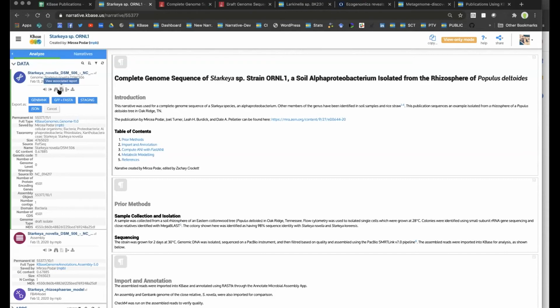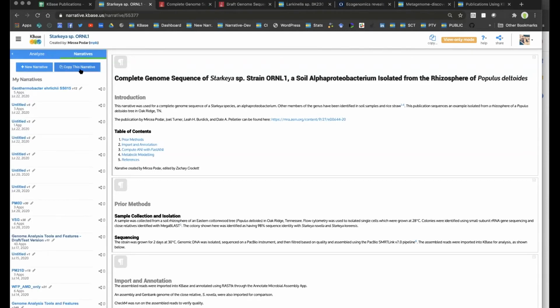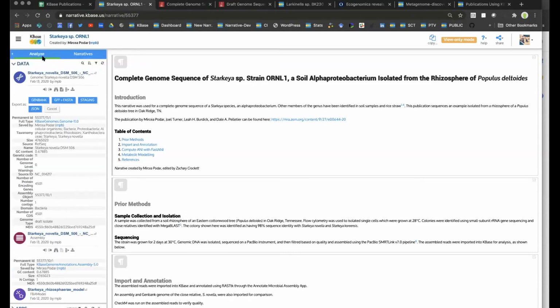I could even make a copy of this narrative. If I just wanted to make a whole copy of it for myself, I can do that and change the parameters, rerun tools, add new tools, etc.